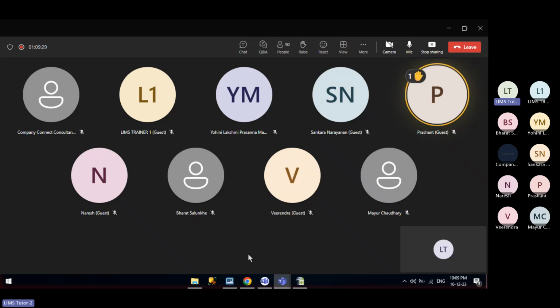If it is 7, it will be converted to 8. If it is 6, it will be converted to 7. They may give you one or multiple setups or patches, and they will give you specific instructions in which sequence these patches need to be executed.